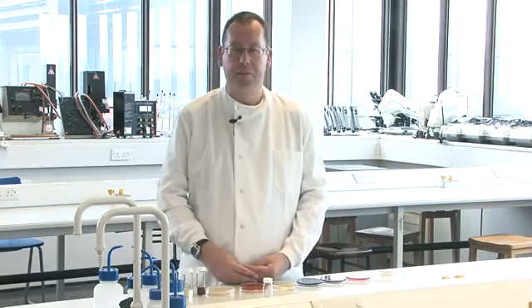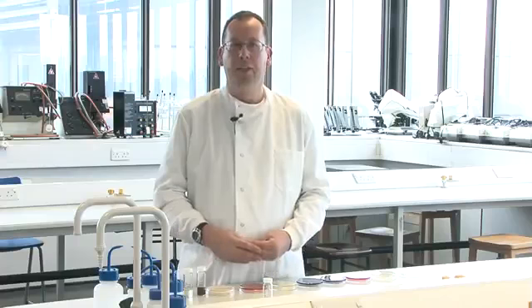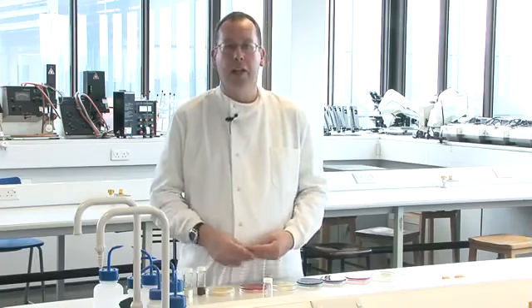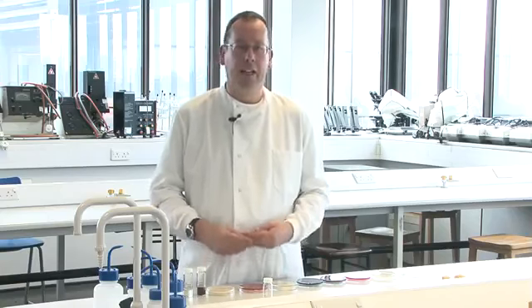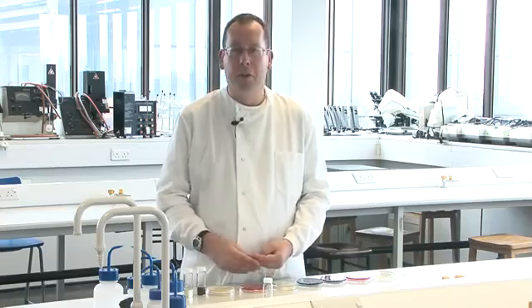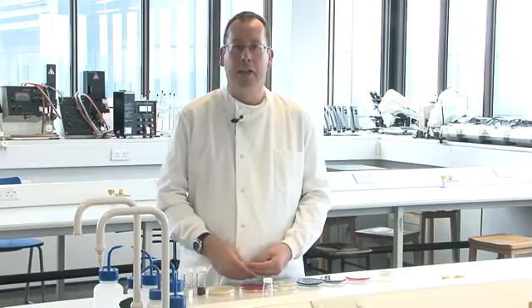So we've covered the basic types of culture media and provided examples of how they're used in the diagnosis of infection. Now, what also needs to be considered is the temperature and atmospheric conditions under which these plates are then incubated. Many organisms such as E. coli and Staphylococcus aureus will grow very happily in atmospheric air at 37 degrees C. For others, we need to provide a special atmosphere. Many fastidious bacteria prefer a carbon dioxide enriched environment. So, for example, if we suspect Streptococcus pneumoniae is present, we will incubate in an incubator containing 6% carbon dioxide.